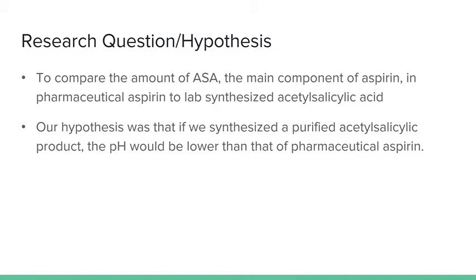To begin with, our intention was to compare the amount of ASA, or acetylsalicylic acid, which is the main component of aspirin, in pharmaceutical aspirin that is sold in drugstores and pharmacies, to lab-synthesized acetylsalicylic acid. We were going to compare this to pH with a pH sensor.